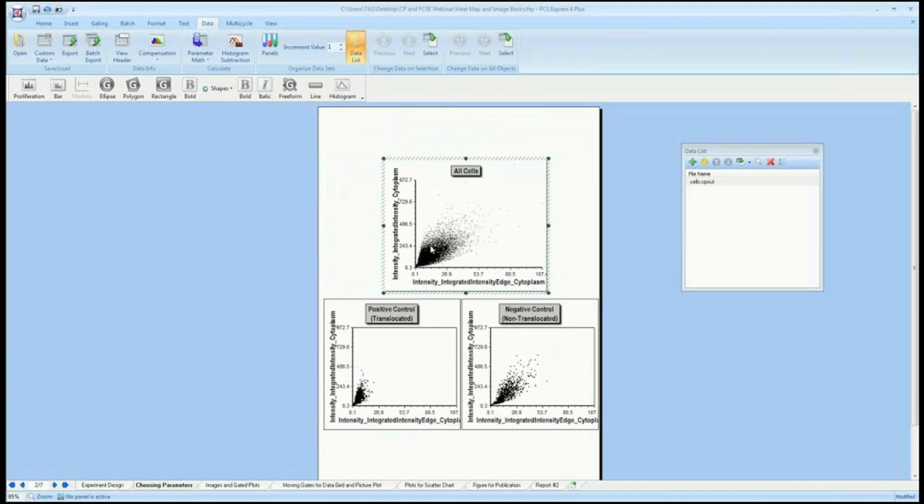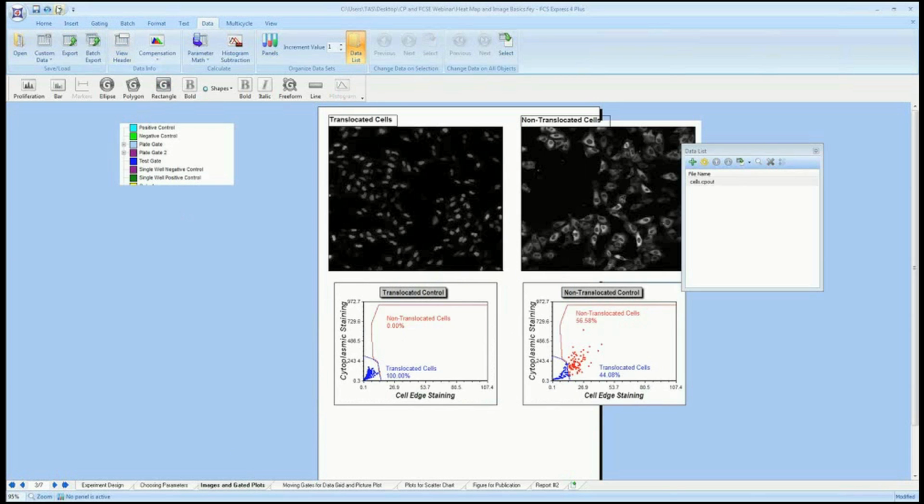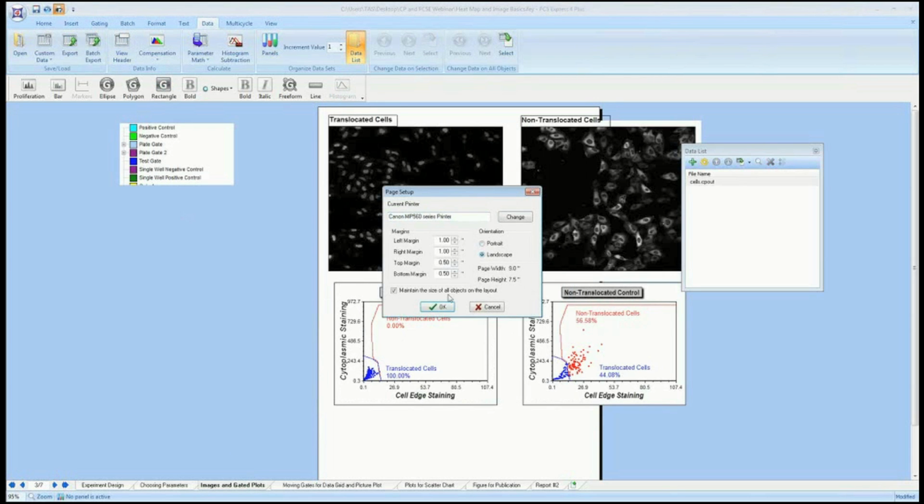So this is everything from all the images within the heat map. And then we're only going to show the cells that fall within the positive control wells and the cells that fall within the negative control wells. And what this is going to allow us to do is define objective gating populations for our experiment, right?